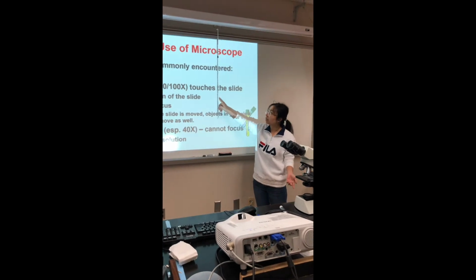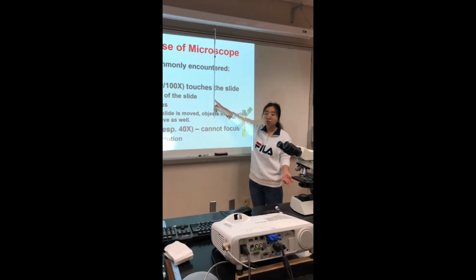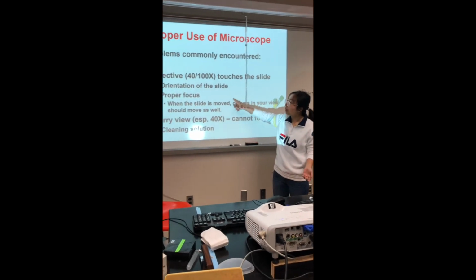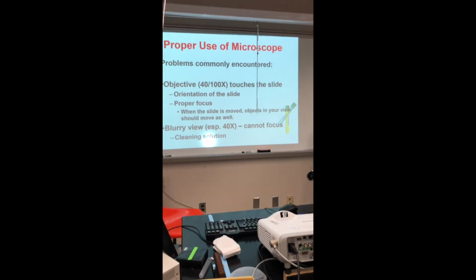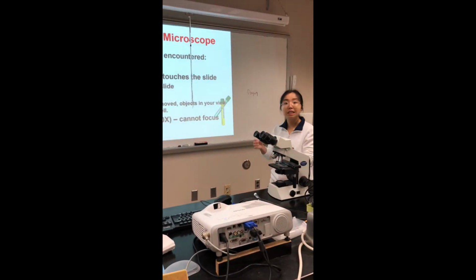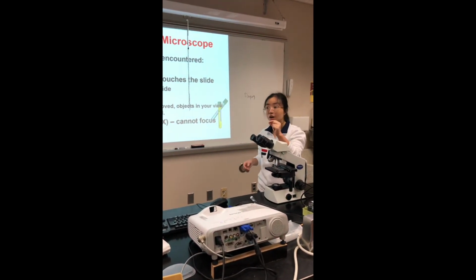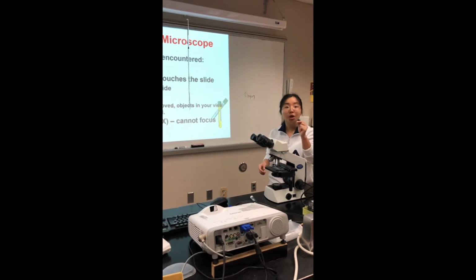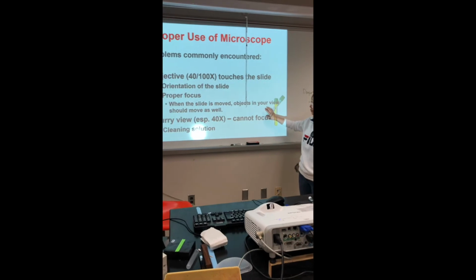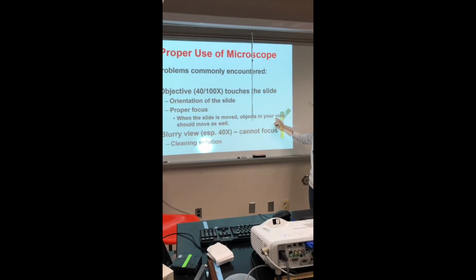So this would be the issue where you cannot focus. Make sure you get the correct side. For proper focus, you want to use the fine focus to adjust to that position. Only that position allows you to get focus of everything. So adjust the fine focus.